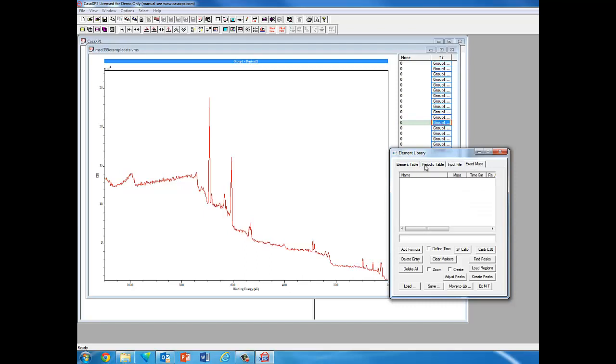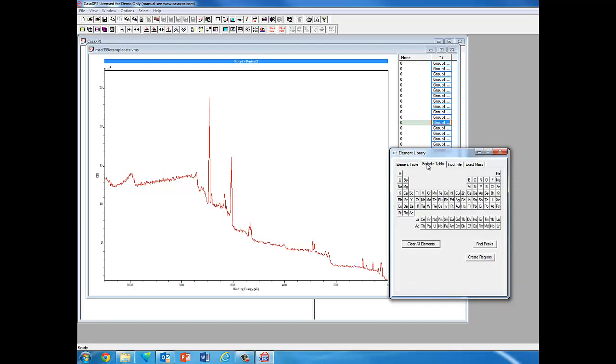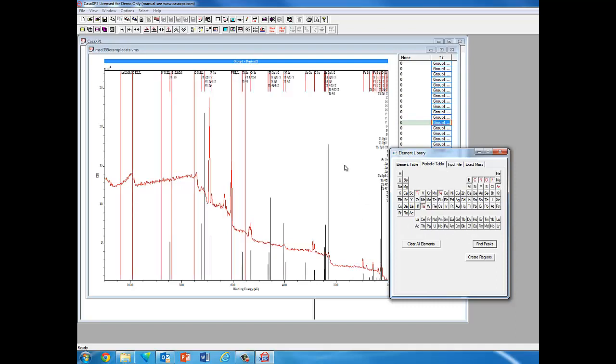If we just stay with the periodic table, and then if we pick Find Peaks, what happens is the program will actually go through and find all the peaks, or what it thinks are the peaks, and then try to identify those. In this case, some peaks here.